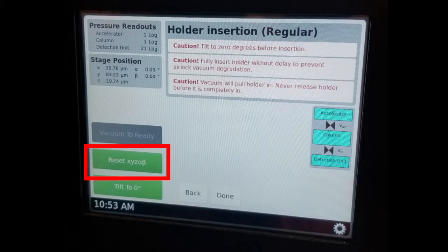Prior to inserting the holder into the column, we need to reset the stage coordinates. This can be done on the TEM software or by the touch screen on the TEM. The column valve should also be closed.